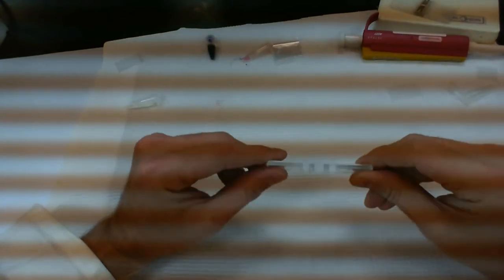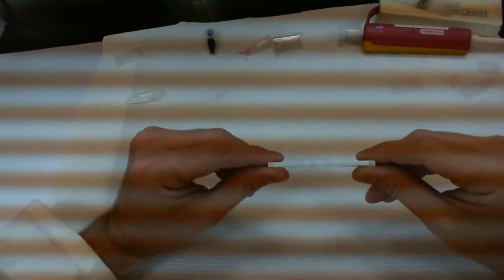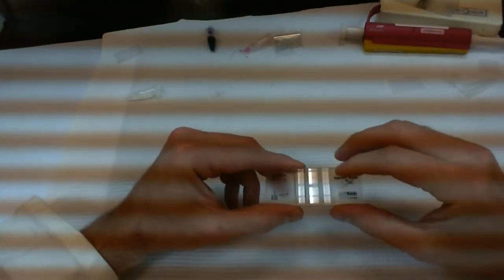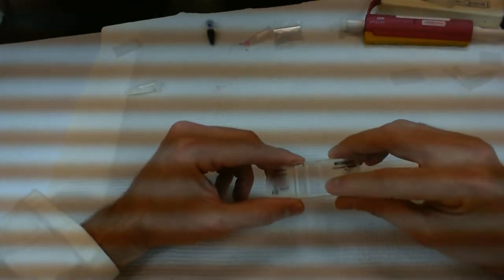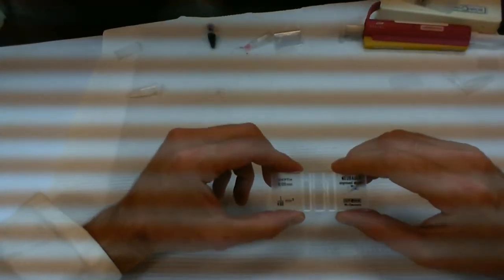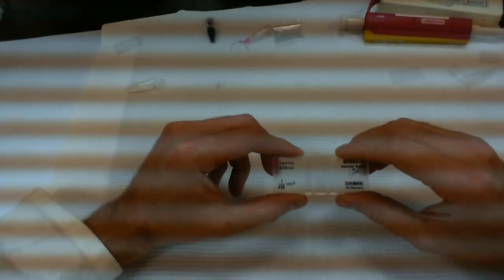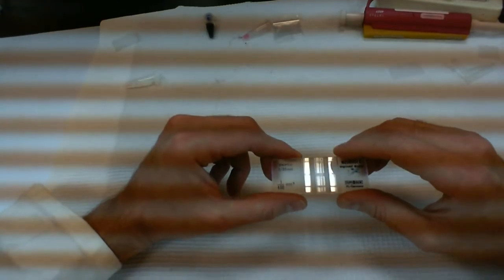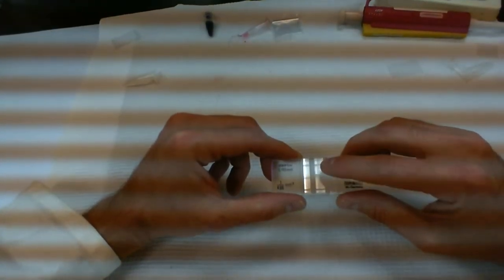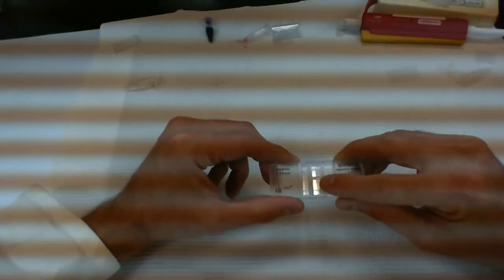is just a thick slide. It's a very thick slide, much thicker than a typical microscope slide. And it does have a few parts. You have the shoulders on the sides, and in the middle we have two counting areas, or two counting chambers. Let me just get the reflection of light so you can see the two areas clearly. So there's a counting chamber here and a counting chamber here.